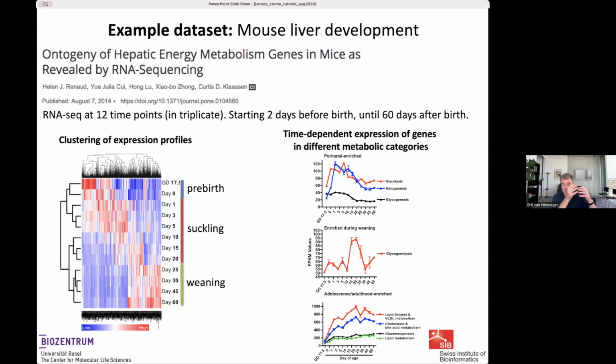It is true that for very low expressed genes, where you have a low number of reads in each sample, the measurement noise does become actually an issue. And we have a version of ISMARA, but I'm unsure, Mikhail can comment on it, if we actually use it, where we correct for this and we take into account that for very low expressed genes, there is also a significant measurement error. But the general answer is that in general, this does not play a big role. And the reason it doesn't is because the error in the model is anyway large relative to the measurement error. Okay, so I hope this answers the question.